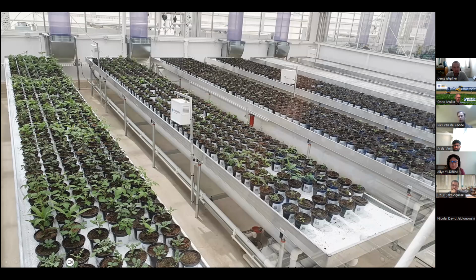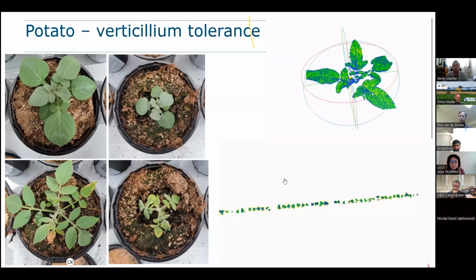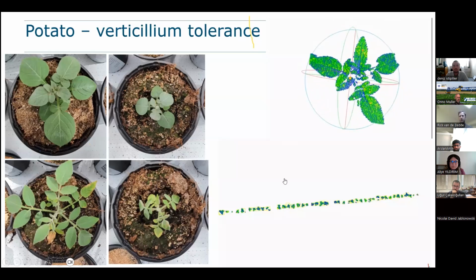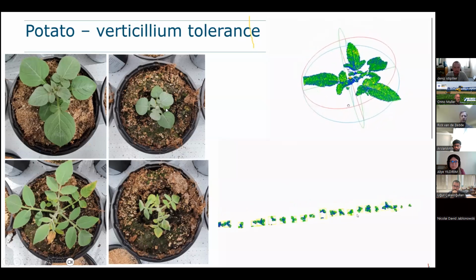And we have inoculated these soils with fungi. And then we monitor how the roots interact with the fungi by simply looking at the shoot. And that is completely straightforward if you have the tools and the scale that we managed to purchase. So we take a top view picture of these plants.